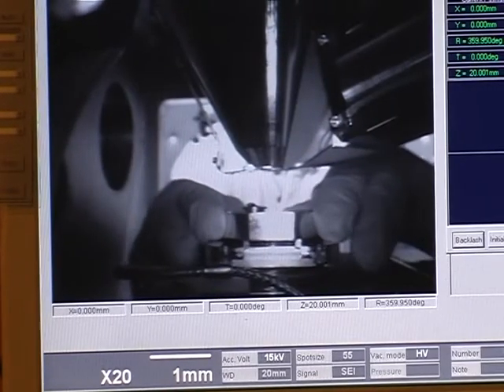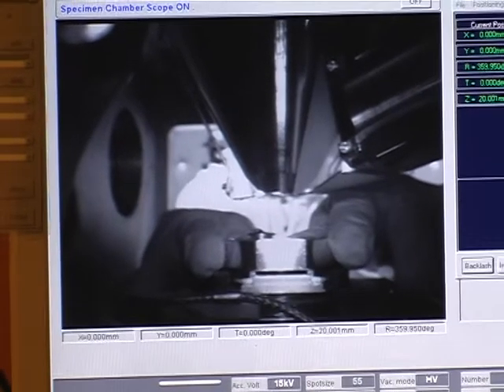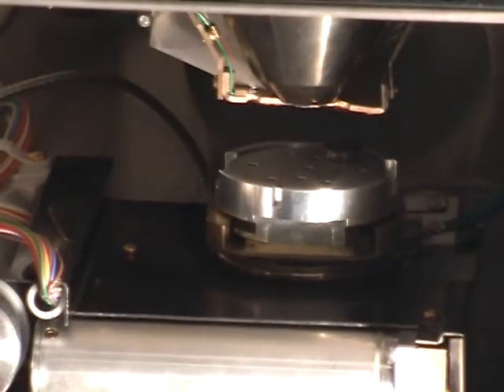Insert your sample by carefully pushing the sample stage onto the dovetail mount. Do not insert a sample that is any closer than 10 mm from the bottom of the backscatter detector.